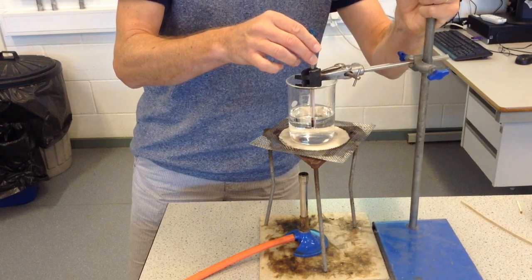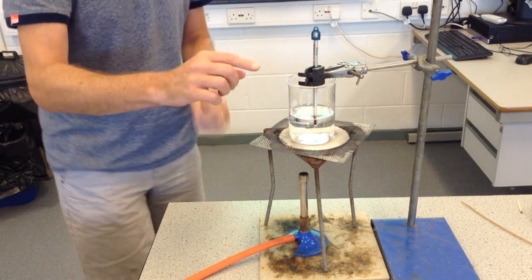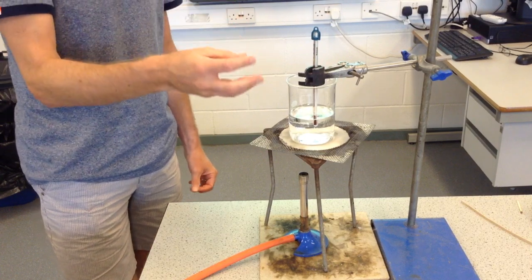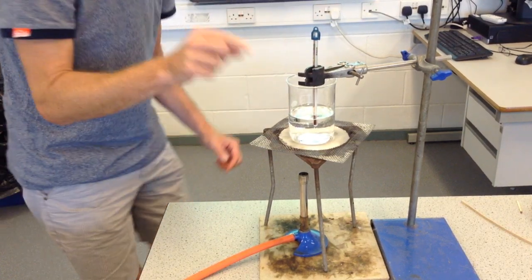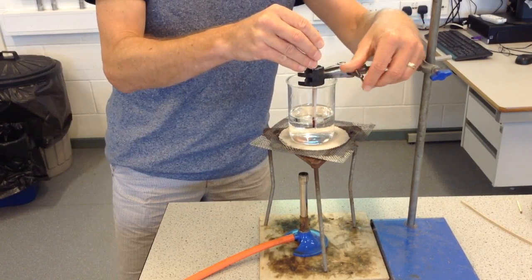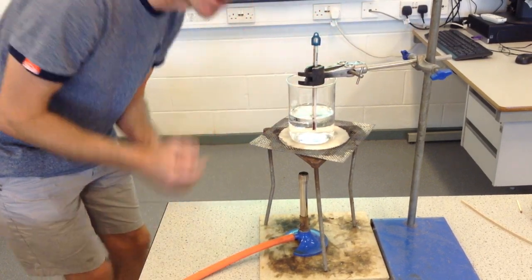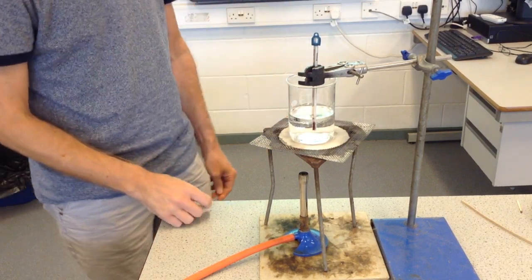I'm going to move that into position. It's important, whenever you measure the temperature of anything, to make sure that the bulb on the thermometer — that red bit at the bottom — is touching the material that you would like to record the temperature of. So I need to make sure that the bulb is in the water, not touching the glass, right at the centre of the water.